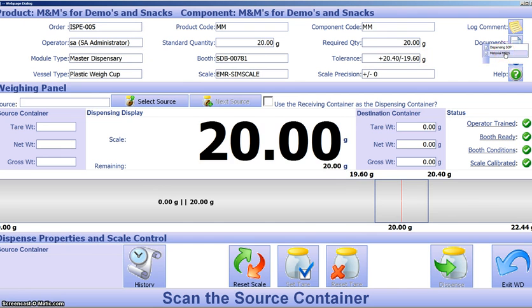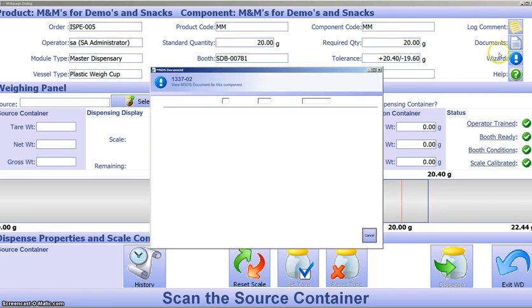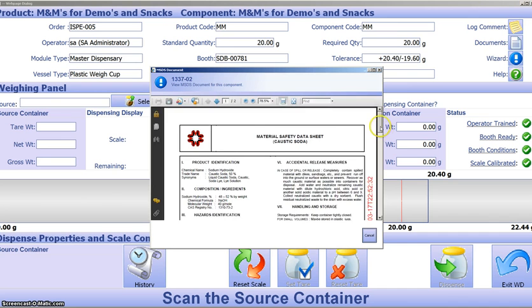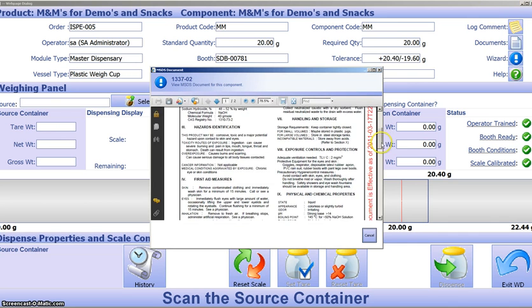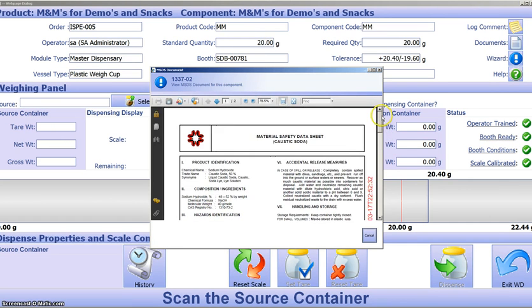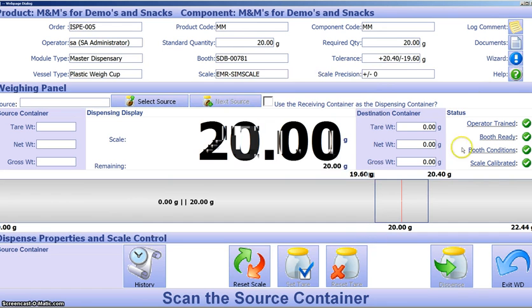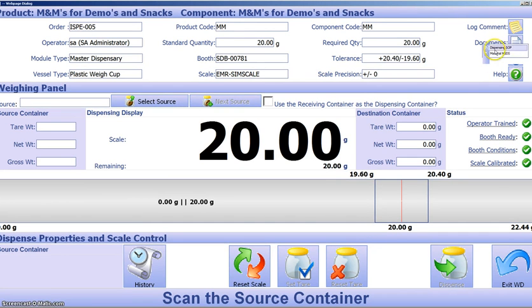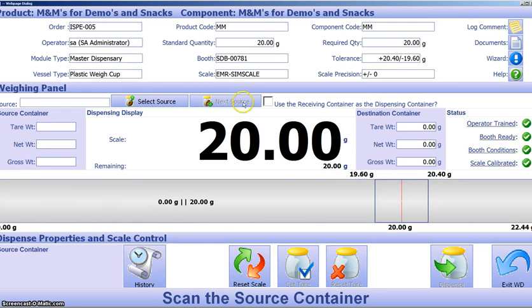We also have information on documents, so if we were to pull up the material MSDS, for example. This isn't for M&Ms, but you get the example there. We have that information at our hands as well as the dispensing SOP. Down here.